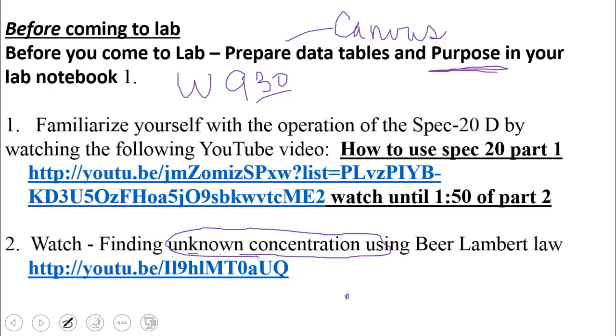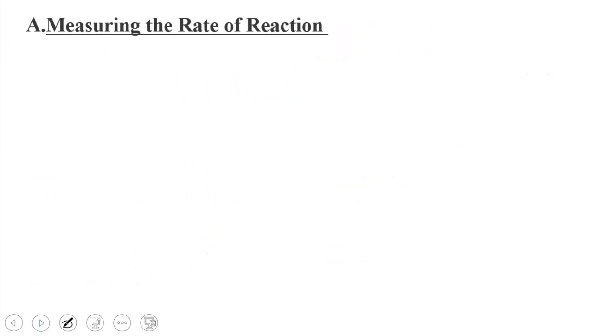I will actually be doing the calibration curve for you before you come to lab. I will give you the calibration data from some known salicylic acid solutions so that we don't have that part of the lab to redo again. We did it last term. I'll give you that information.